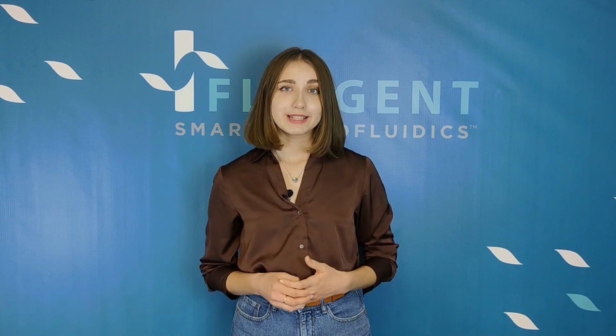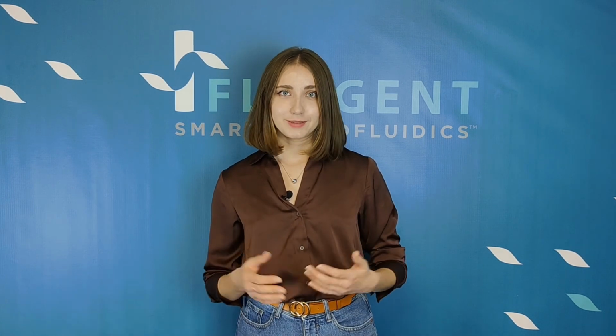That's it for now. We hope this video helps you feel confident getting started with using OxyGEN with your system.